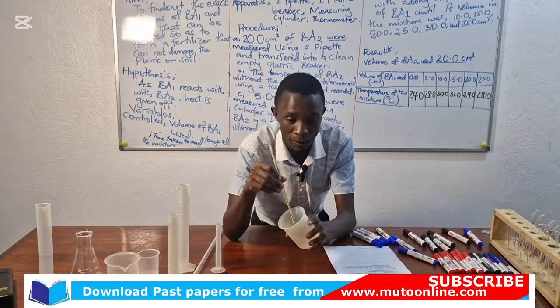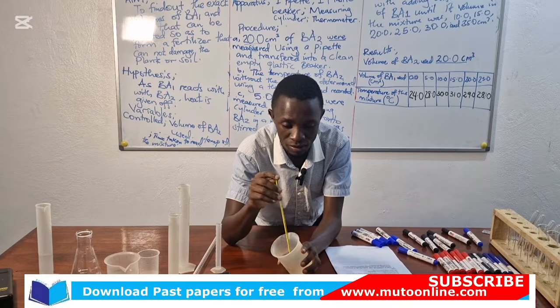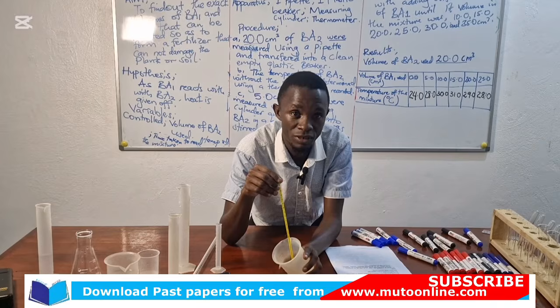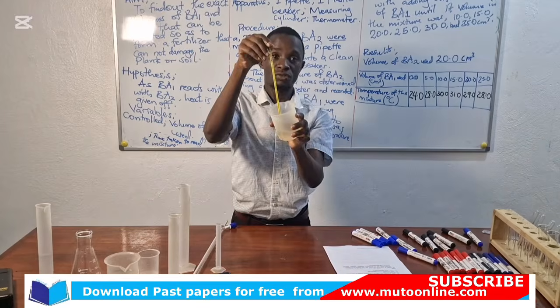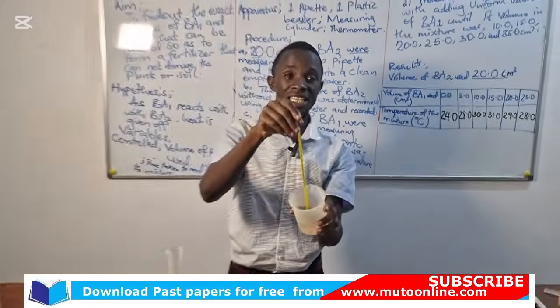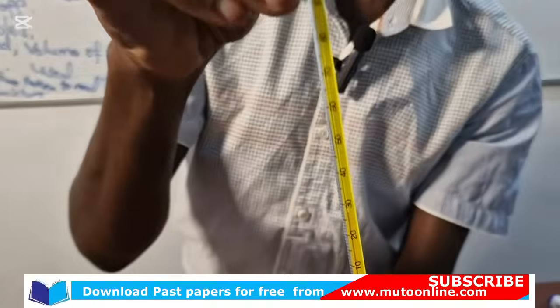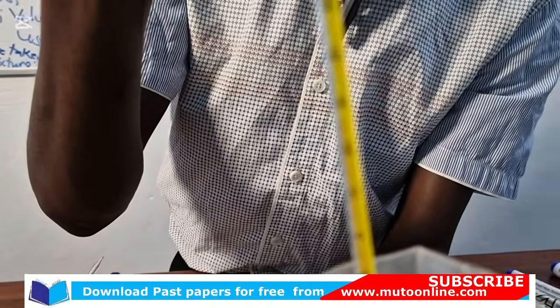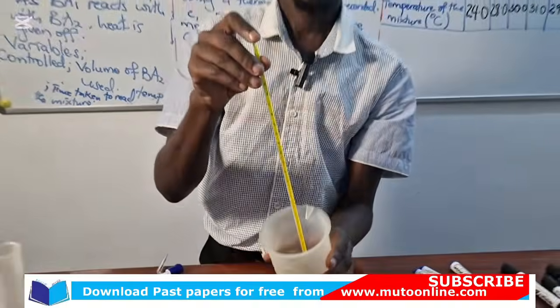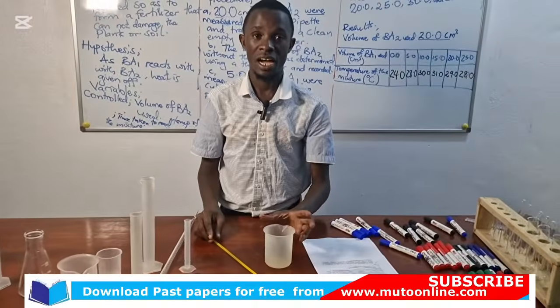And members, my new temperature is stably stopping at 27. We can check. It is stopping at 27 for 30. So we keep on repeating the procedures. We repeat the same procedure after adding more 5.